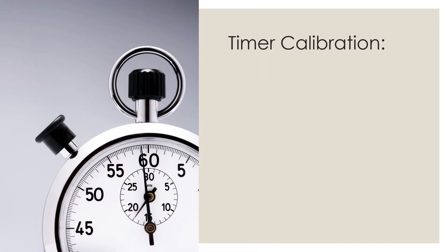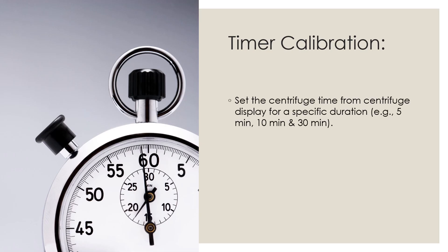First we will discuss the timer calibration — that is, how to calibrate the timer which is built into the centrifuge machine. Set the centrifuge time from the centrifuge display for a specific duration, for example 5 minutes, 10 minutes, or 30 minutes. This depends on the type and range of centrifuge, and you can set the timer as per the respective make and model. Refer to the vendor document to know about the timer range.